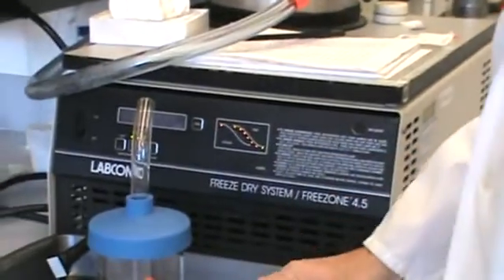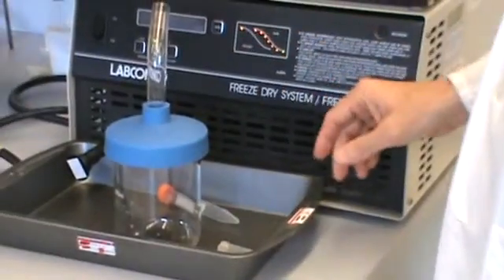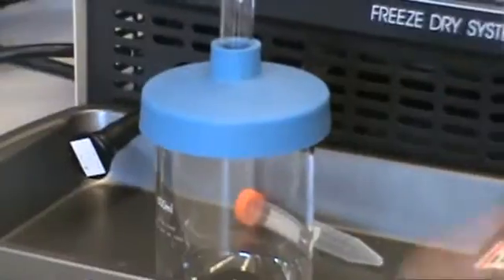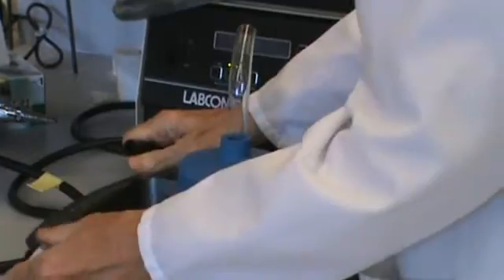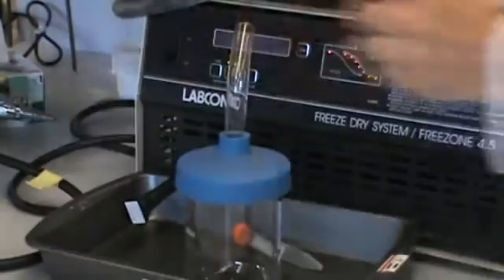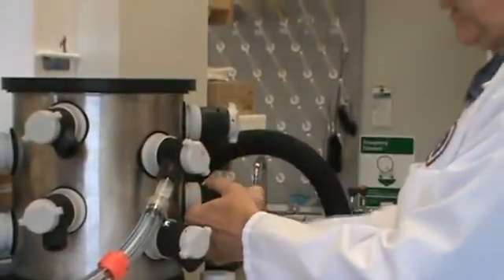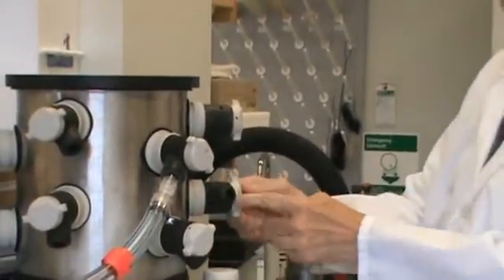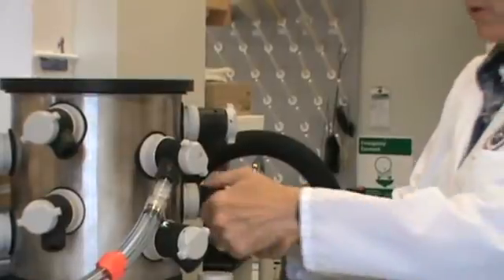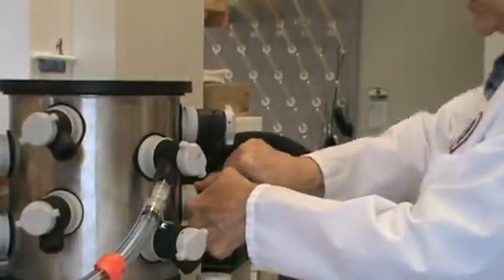First thing is to seal the vacuum, as we leave it open for storage. We leave the plug open, the drain plug open, so you seal that. Find the port that's been left open, usually one port's left open. The slant here is toward open, so you close that.